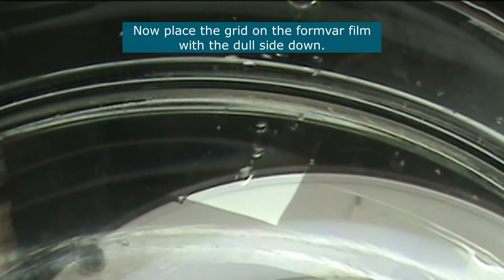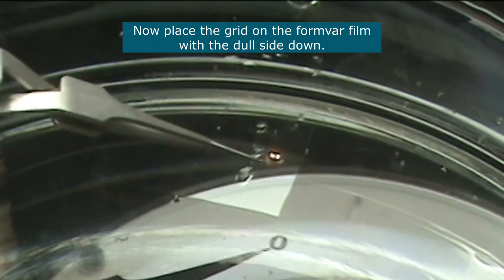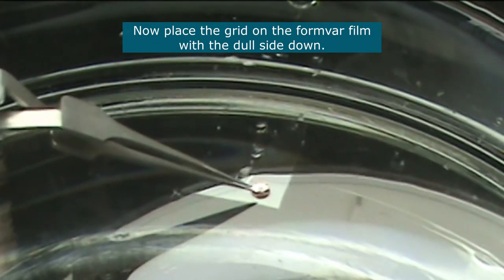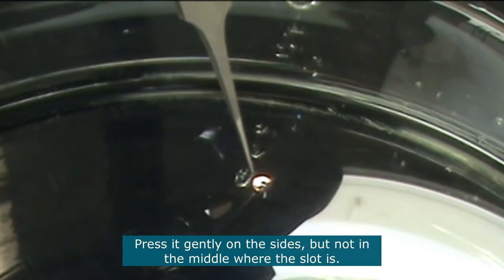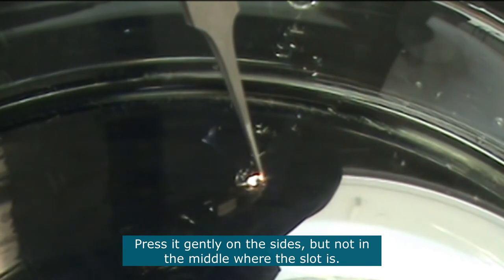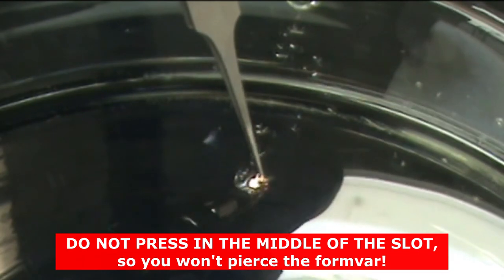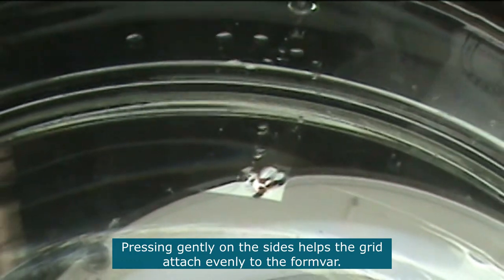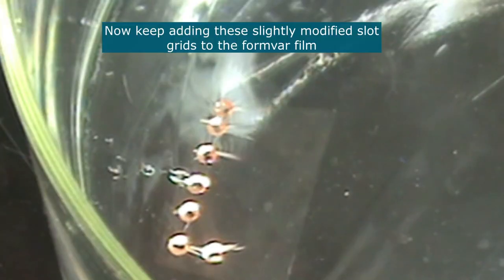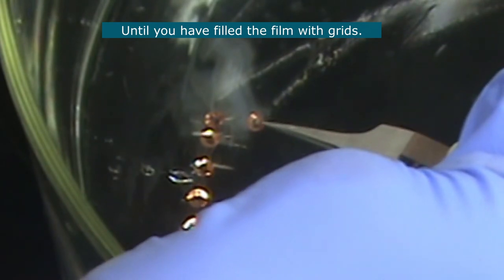Now place the grid onto the formvar film with the dull side down. Press it gently on the sides, but not in the middle where the slot is, just so that the grid attaches well to the formvar. Now keep adding these slightly modified slot grids to the formvar film until you have filled the film with grids.